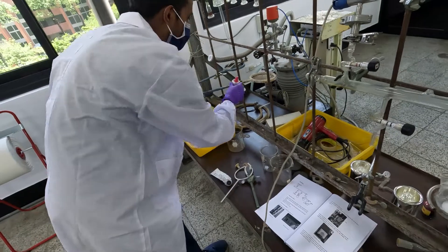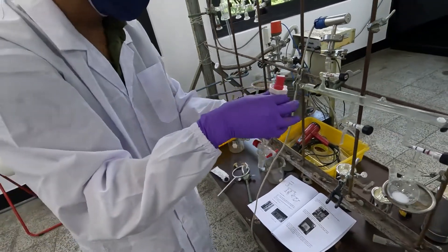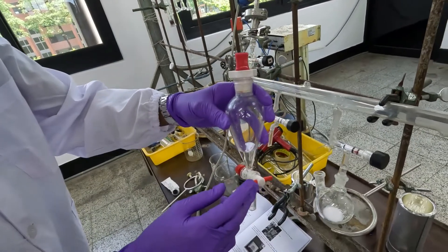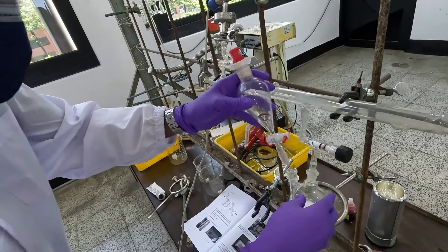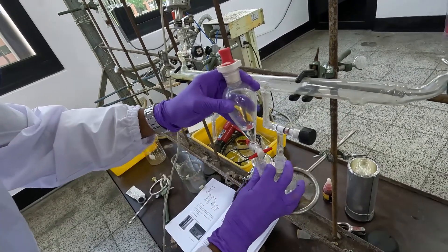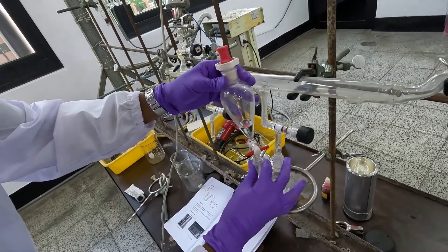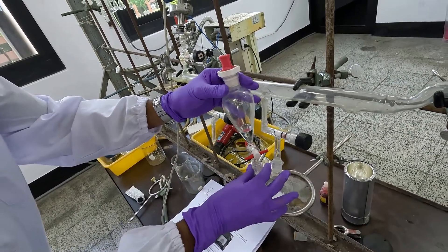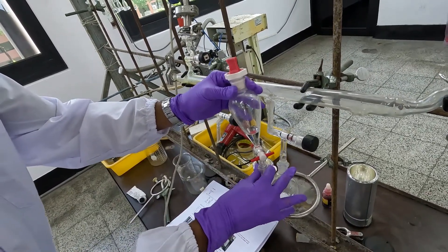After that, I am going to fix the dispensing funnel. Make sure this valve should be closed. If it is not fixed well, you can also use some grease on this tube as well.